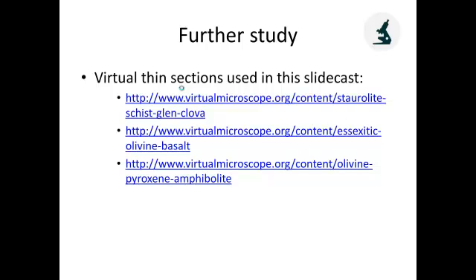So, go to the thin sections at the end of this slide cast, take a look at them, explore them, see if you can find end sections, see if you can start to use cleavage to recognize minerals in thin section.